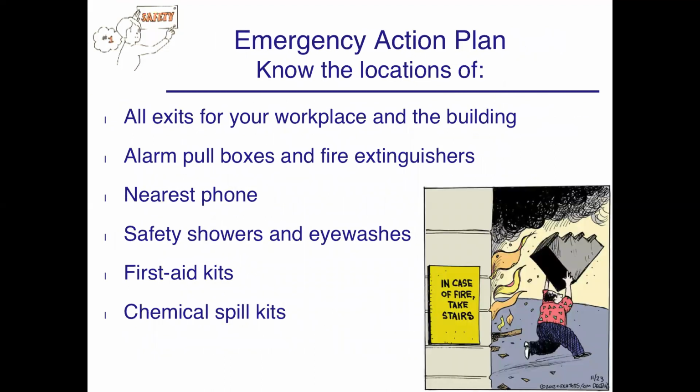You should also be aware of the location of all the exits for your workplace and building, the alarm pull boxes and fire extinguishers, the nearest phone, safety showers and eye washes, first aid kits, and spill kits. These will be covered in your site-specific training.